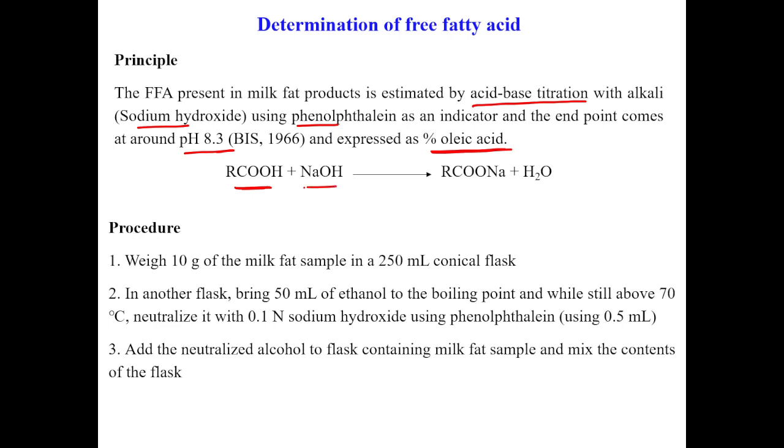will react with the sodium hydroxide that is used as titrant, and then we have the sodium salt of the fatty acid, and the water molecule that is released. So this is the reaction which is happening during the titration.